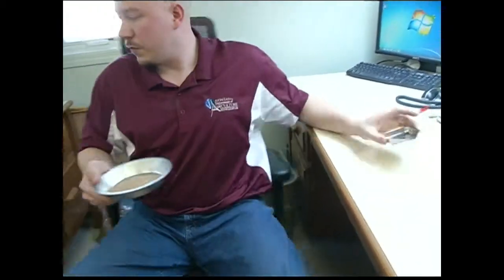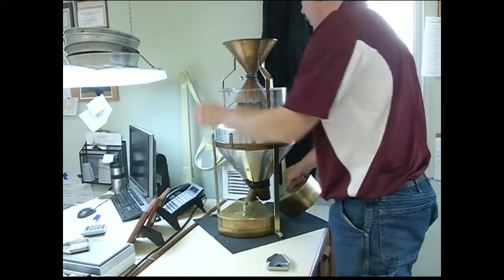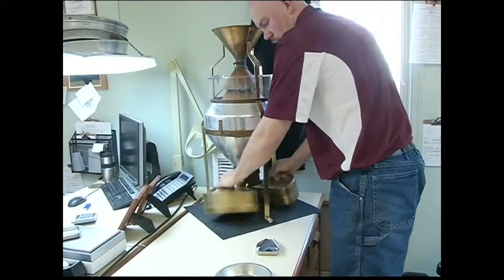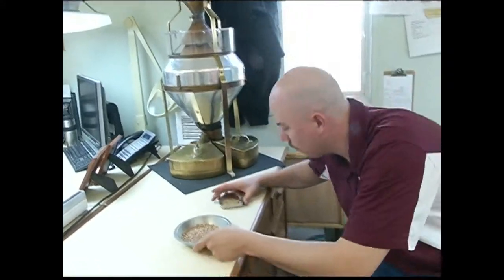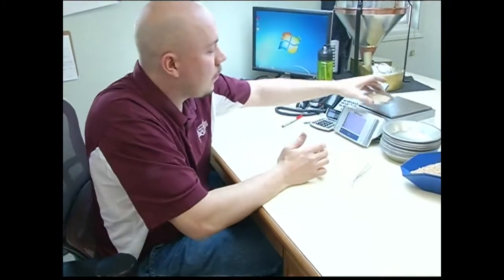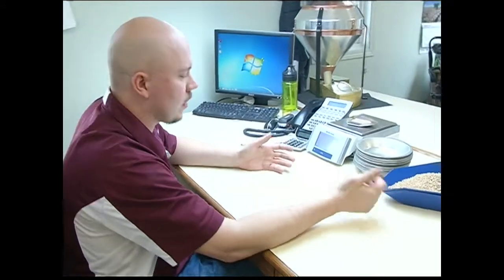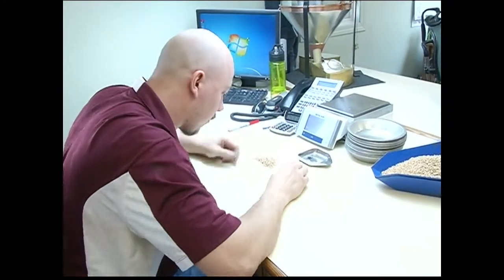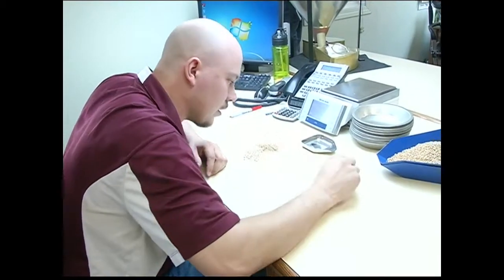So after I go through my 60 gram, I will break it down a couple more times to my damage picking portion, which is 15 grams. And these kernels I'll go through individually and pick out damage, sprout damage, frost damage, mold damage. And if there's insects in there, if I saw any insects, I would look for insect damage as well. Even if there's not, I still keep an eye out for it. This one has some sprout damage in it.